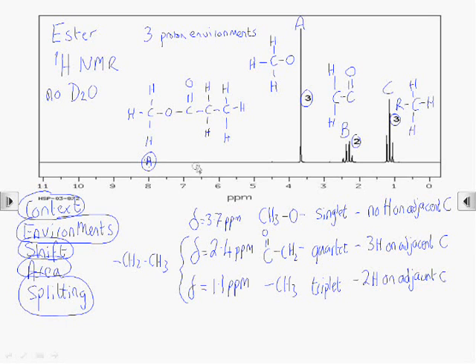We'll just label which protons are responsible for which environment in our molecule. And we can see that it's all self-consistent.